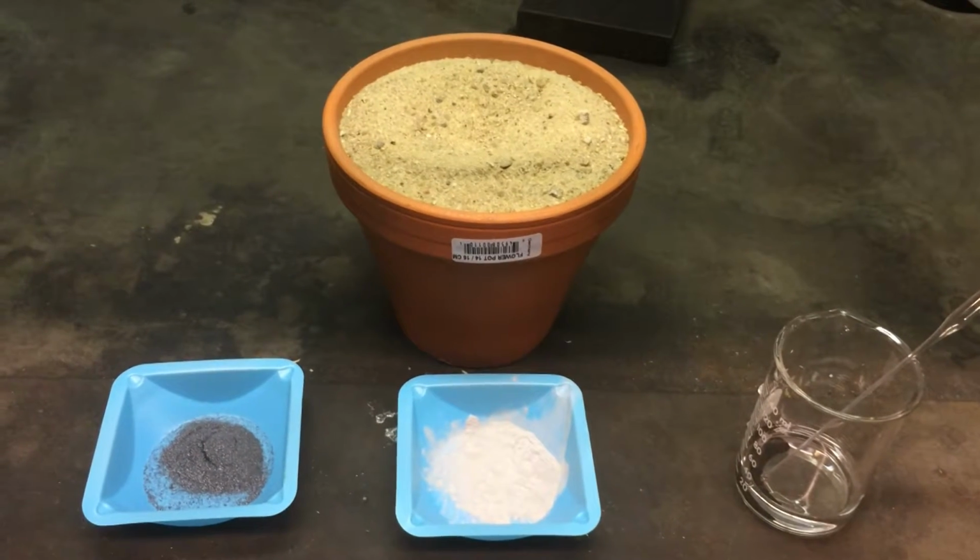Welcome, and today in our second series of reactions we can't do in the lecture halls, we're actually going to be mixing iodine and aluminum, and take a look at what happens. It's pretty cool.